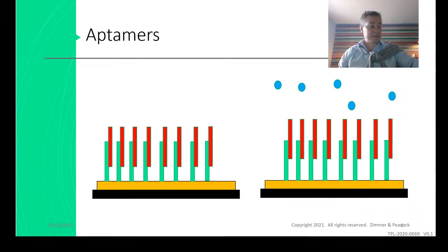It's certainly at a distance. If I was looking for a quick fix, I would potentially add about 5 millimolar ferrocyanide to your buffer. And then I would run your EIS experiments, but with an offset of about 200 millivolts, and see if suddenly your signal becomes a lot clearer. So that would be my quick fix, Phil.